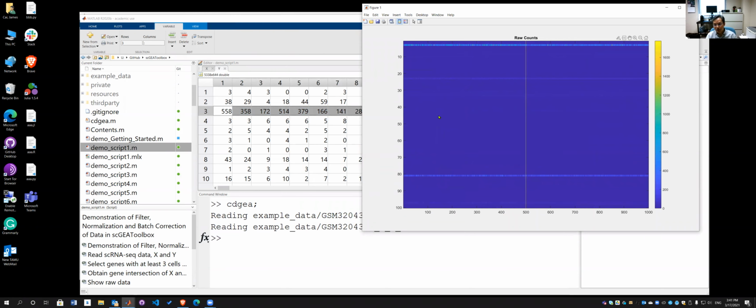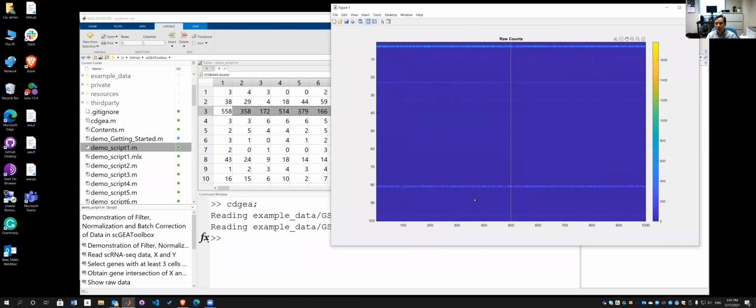And the rest of the genes' expression level is relatively low, several hundred times lower. That's why you see a lot of this blue. And one of the genes, maybe number 81, has a high expression. So this gives you the overall impression of your raw data.